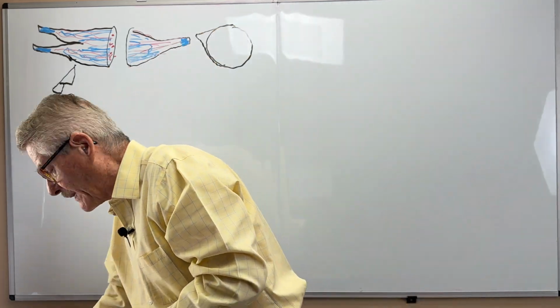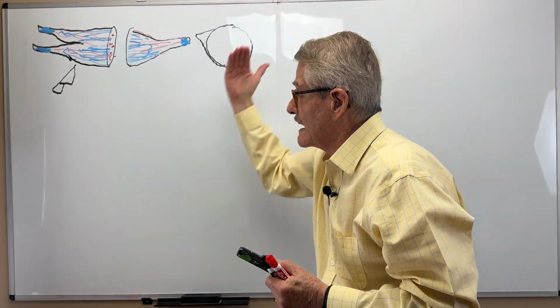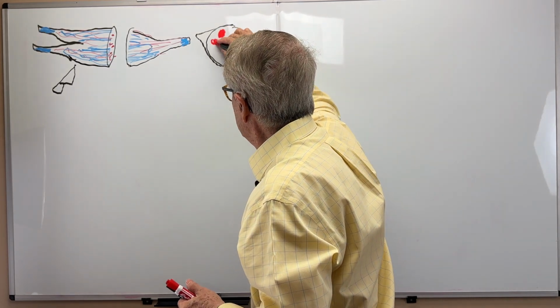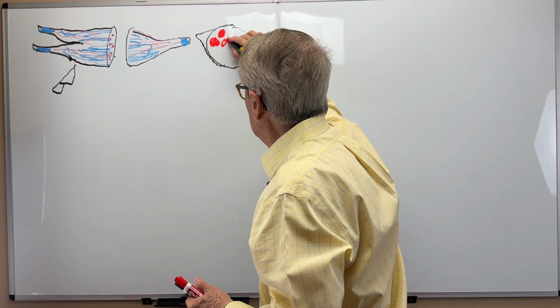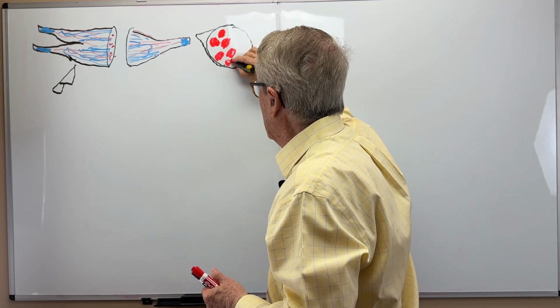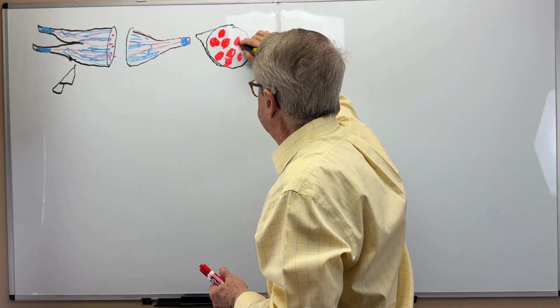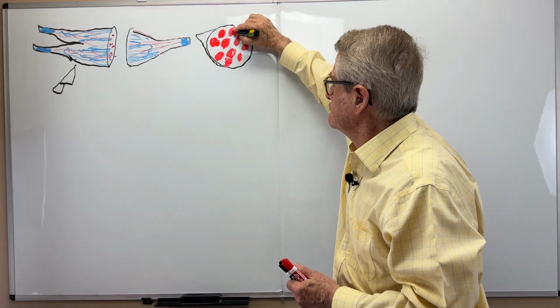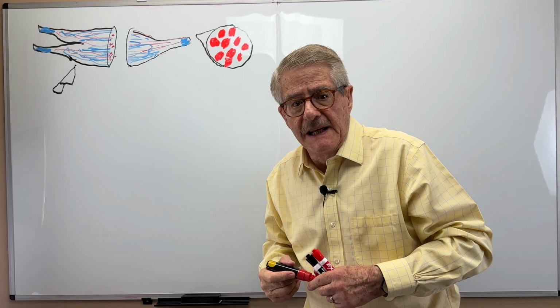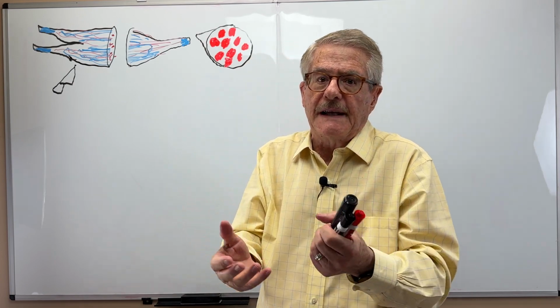So when you cut the muscle like that, you see the cells that have been cut in a transverse fashion, and they are going to look polygonal or ovoid, and they're going to be red, eosinophilic when you cut them in any direction, because muscle has numerous filaments of protein, actin and myosin, which are eosinophilic.